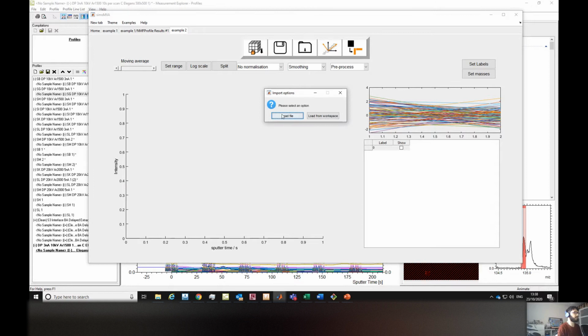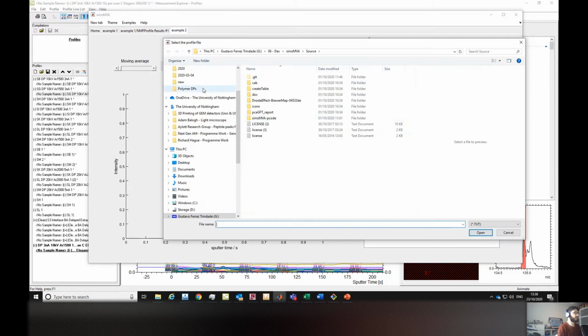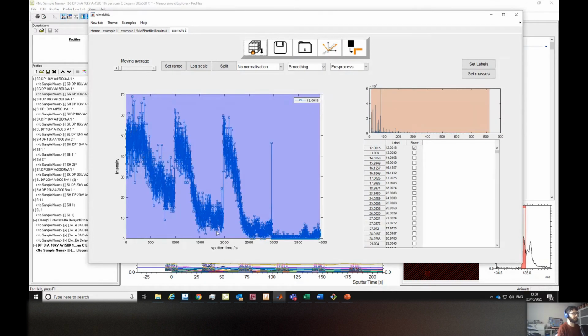Load file. And I have these 4 files. Then it created this kind of joint profile. As you can see, for these ions specifically, it is very different because we know it's the only one outside of the worm.